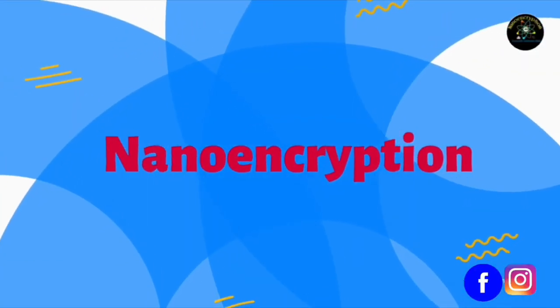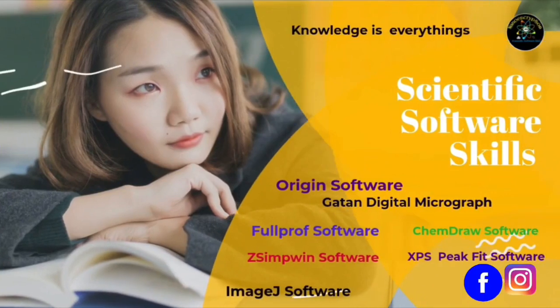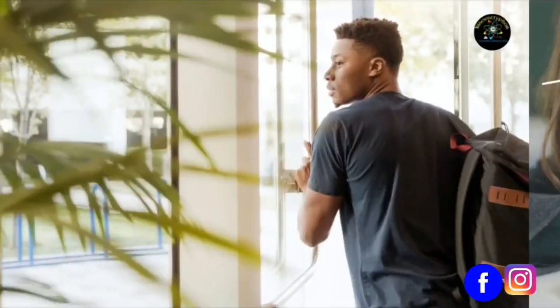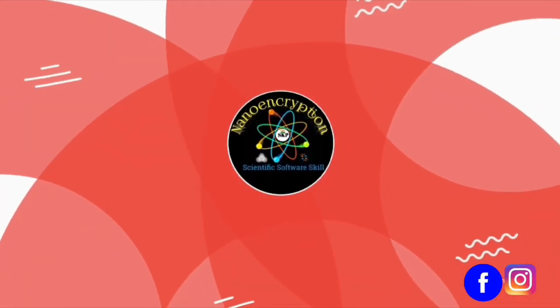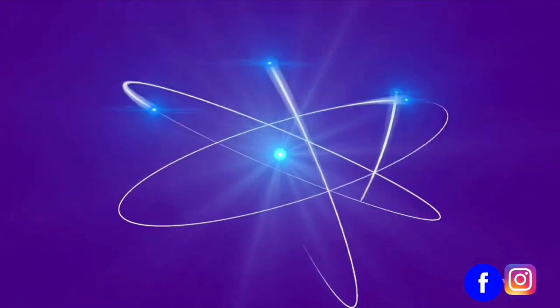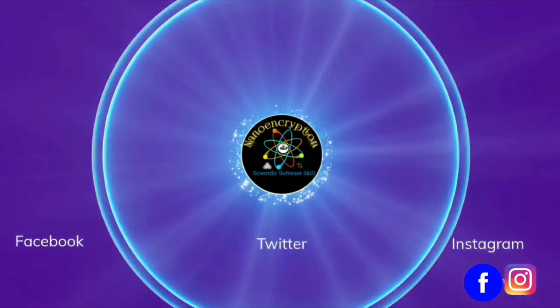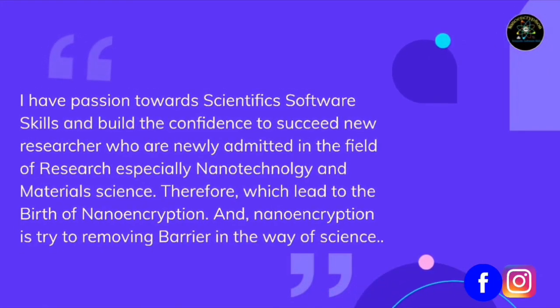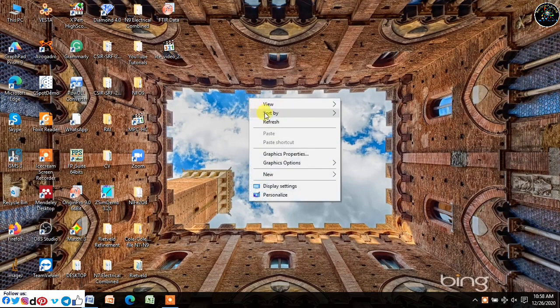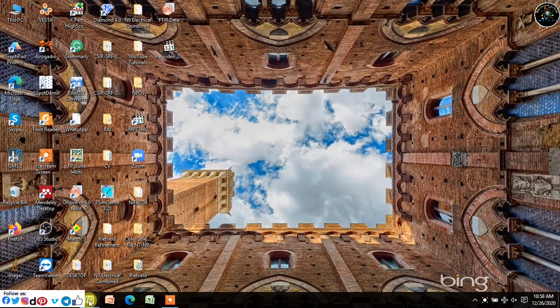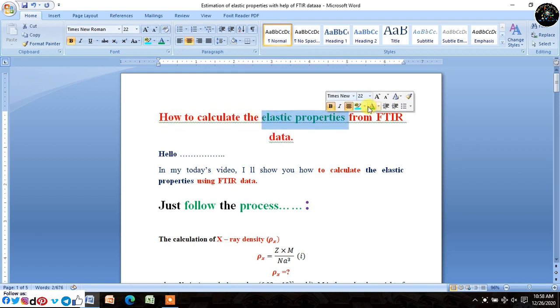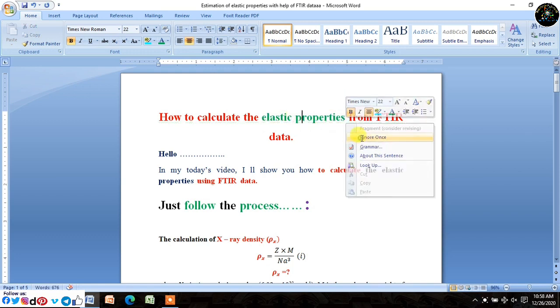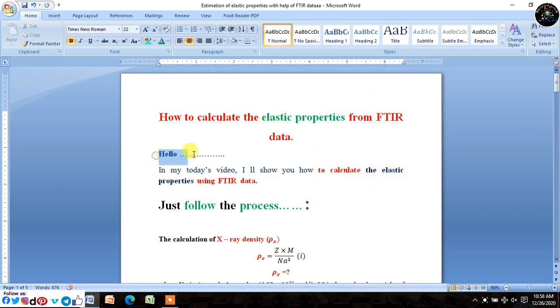Welcome to Nano Encryption. Today, in this tutorial, I will show you how to determine elastic properties with the help of FTIR data of spinal ferrite material such as cobalt ferrite, nickel ferrite, zinc ferrite, and so on. Just follow every step precisely and carefully.